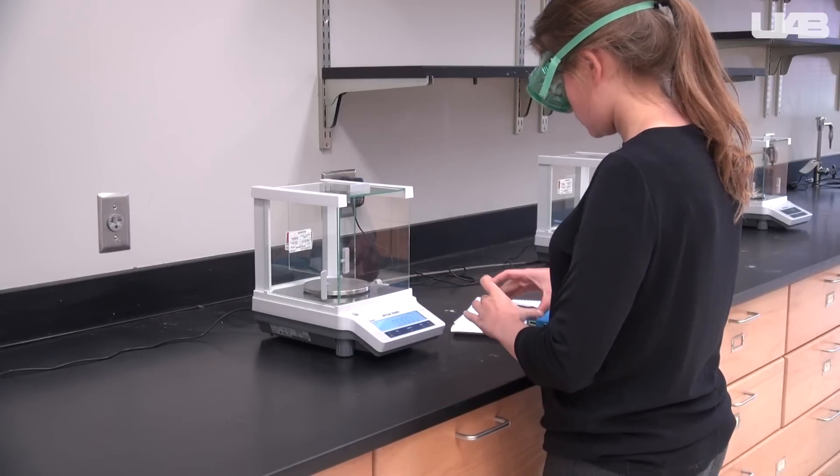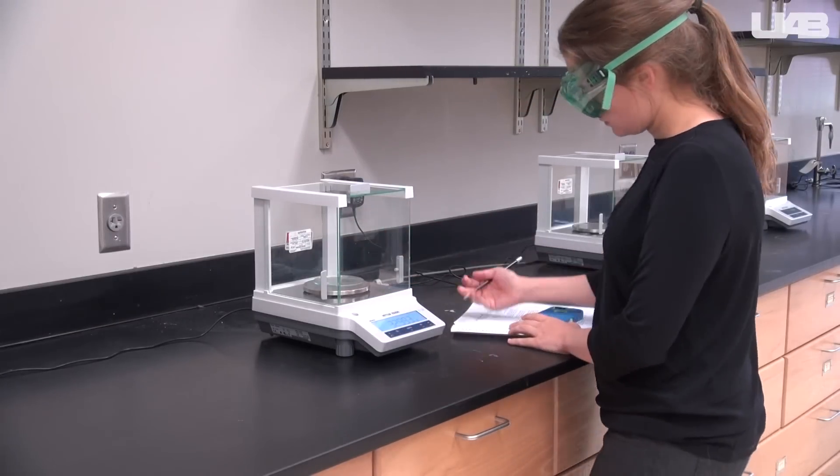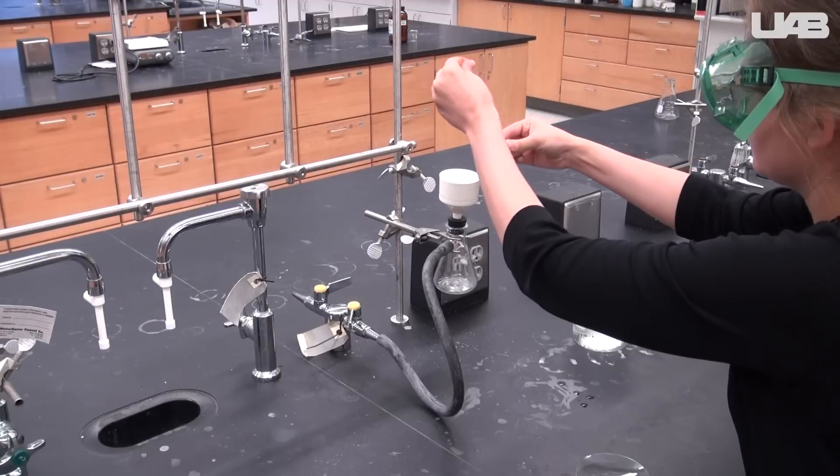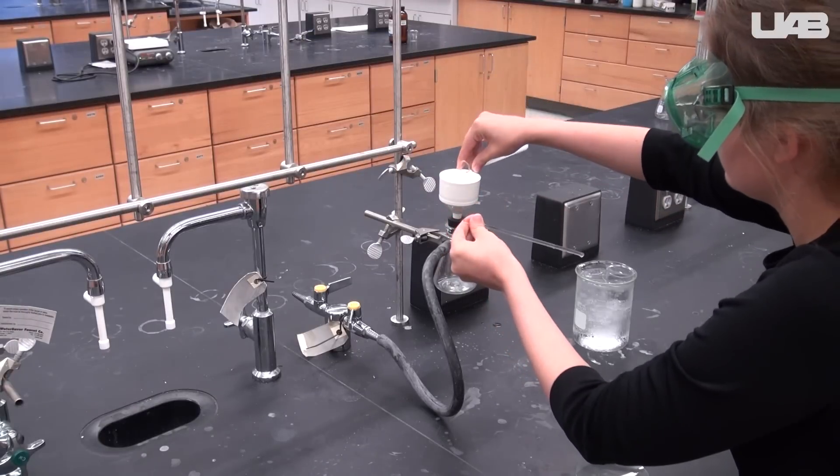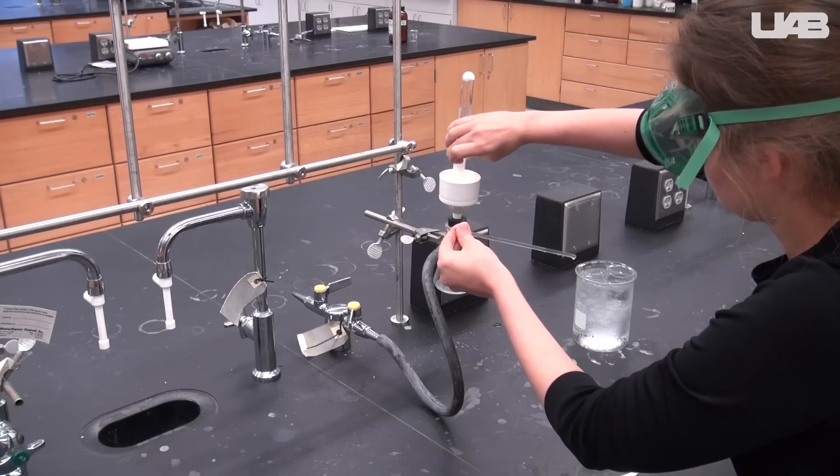We will isolate the aspirin crystals by using a Buchner funnel. Before you do this, determine the mass of a watch glass and record it in your notebook. We have used a Buchner funnel earlier in the semester, so if you don't remember how to use the funnel, review the milk lab video to refresh your memory.